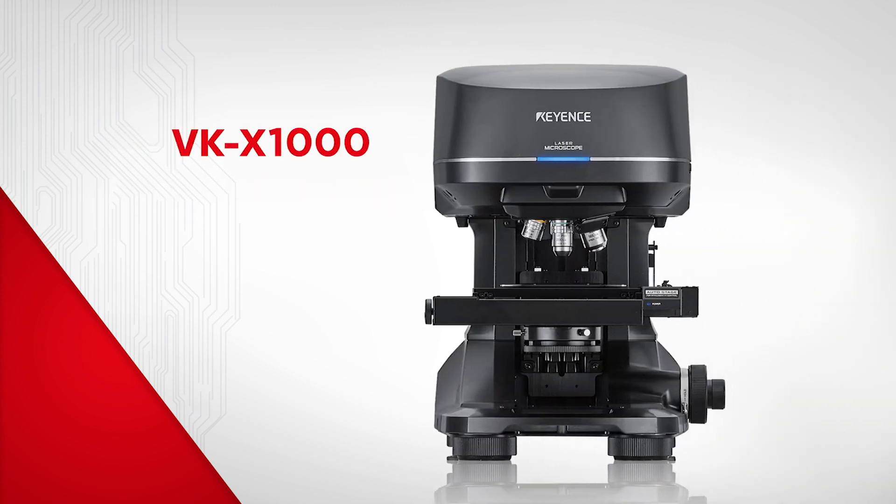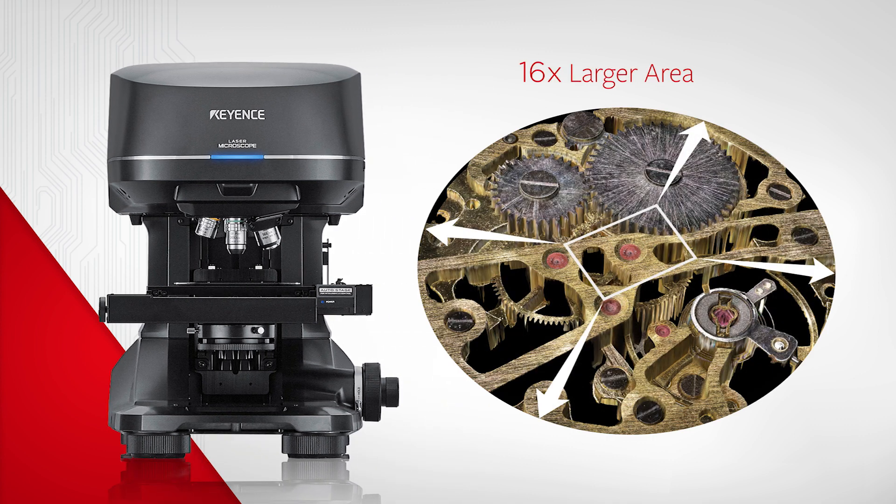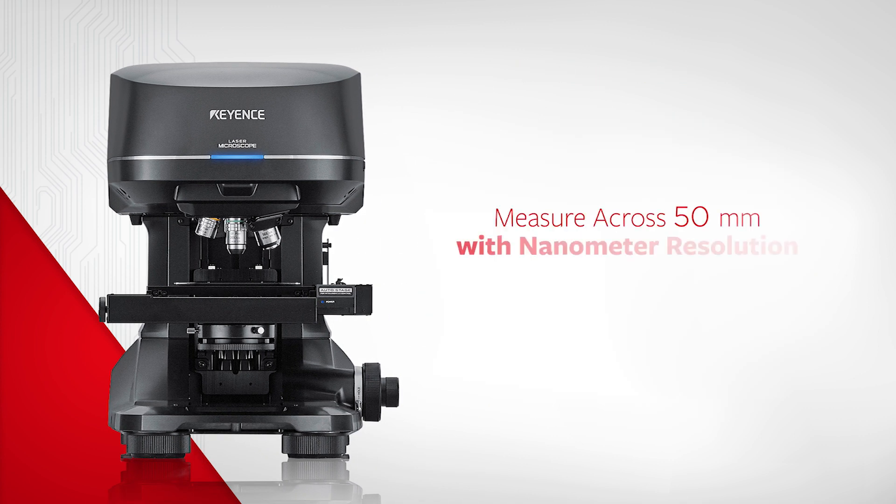The VKX1000 is 12 times faster than conventional laser microscopes and capable of measuring an area 16 times larger. For the first time, measurements across a 50 millimeter area can be quickly analyzed with nanometer resolution.